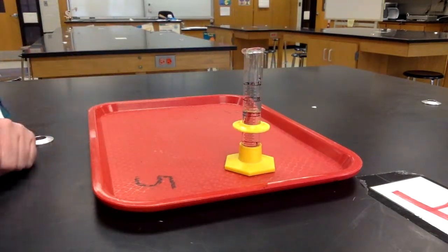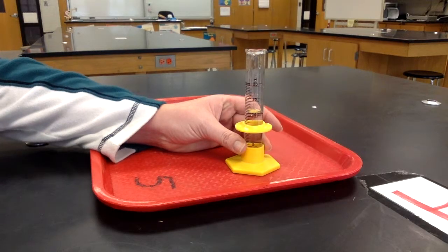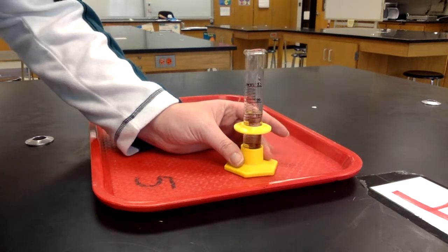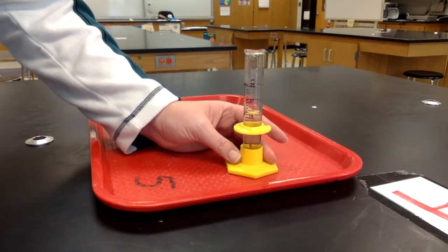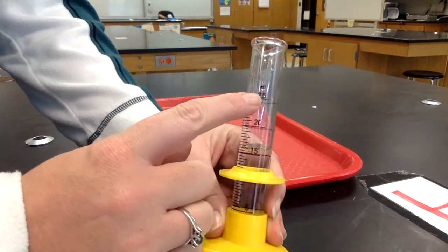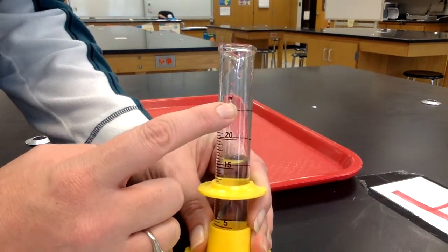I would first measure the amount of water in the graduated cylinder before I put the object in. This currently has 16 milliliters of water. I know it is milliliters because at the top it has ml.